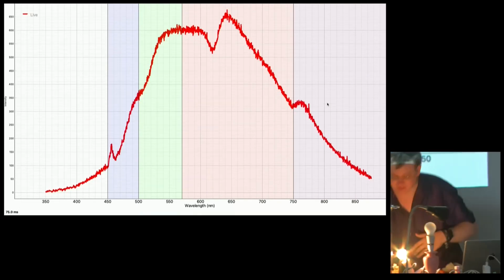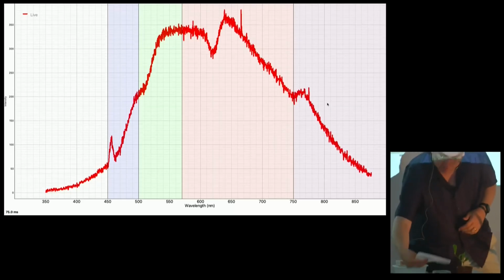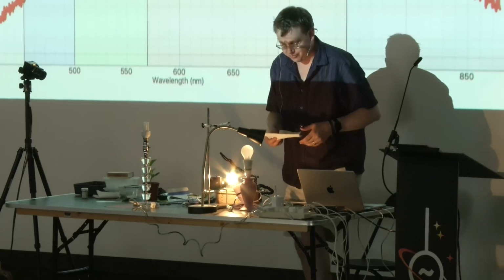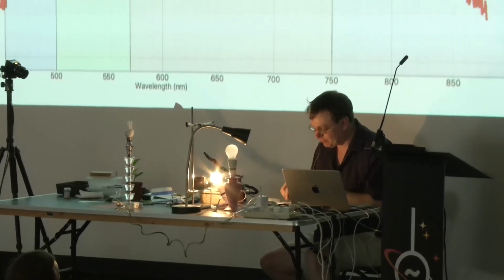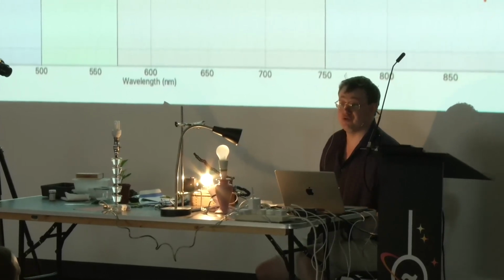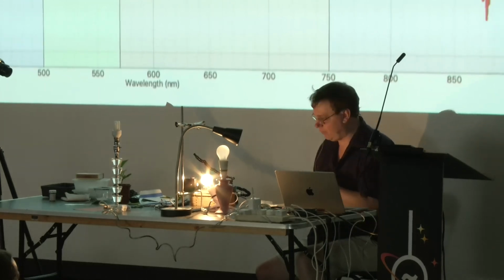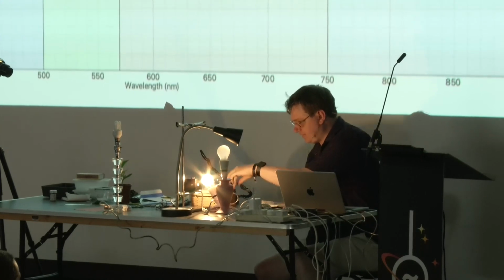What we're then going to do, though, is put some other stuff into this water. Now, I looked far and wide for chemicals I could use to do this that EMF wouldn't shout at me for using on stage, that my wife wouldn't shout at me for using because I might hurt myself, and so on. I decided to use blue food colouring because it's very safe. So this is putting some blue food colouring in here. Whoops, that's just fallen off. That's because I knocked it.